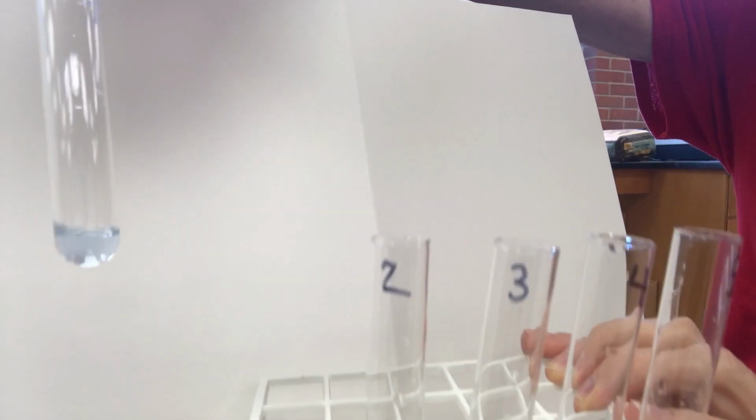Egg albumin is mostly water and protein, and we would expect a positive result from the Biuret test for this macromolecule. So, egg albumin would be a positive control for the Biuret test. The rest remain unchanged.